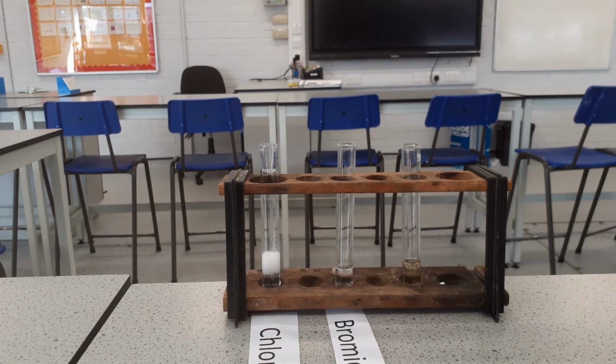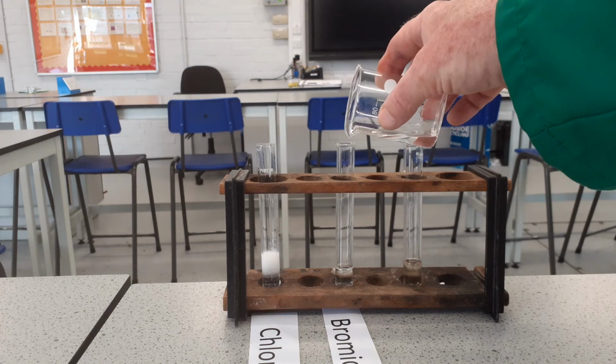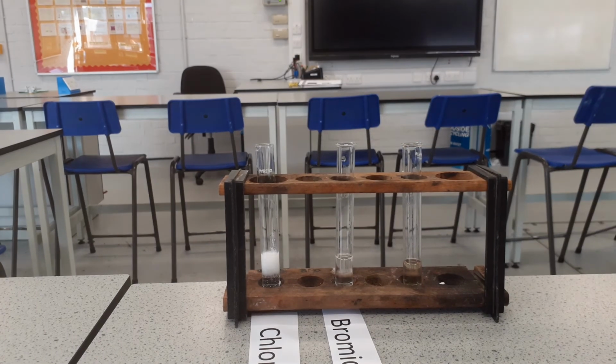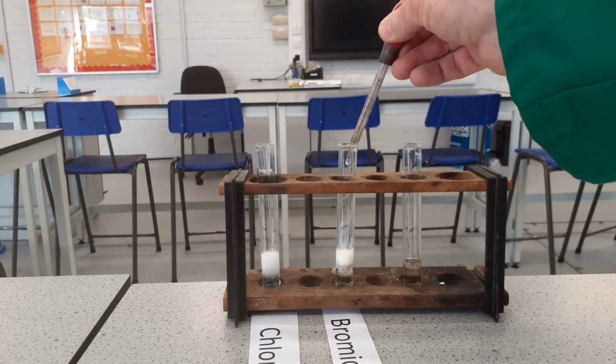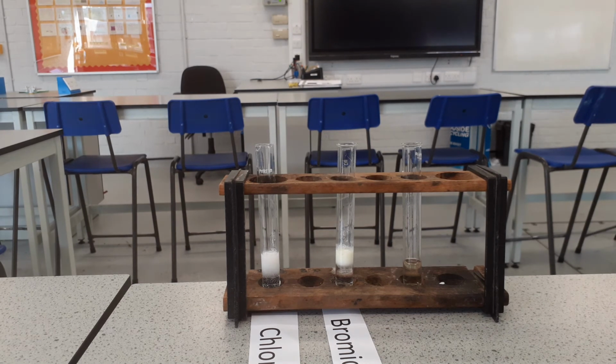Now, the middle one now is a bromide. So again, I add a little nitric acid, and then I add silver nitrate solution again. And again, I get a precipitate, but as you can see, this is a cream precipitate, not a white one.